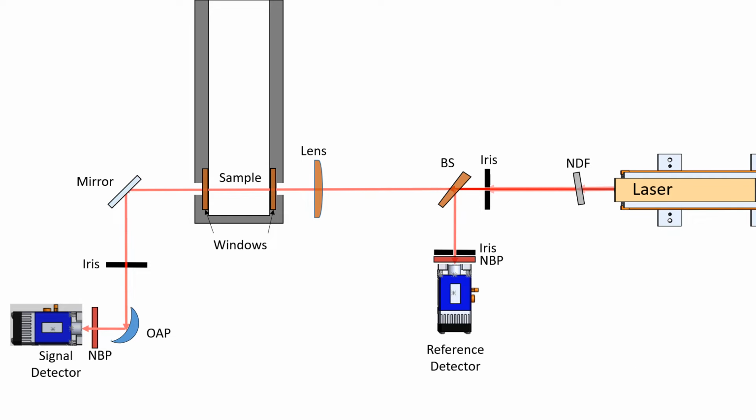With the flip mirrors down, they and the wave meter are out of the laser path. So I've taken them out of the diagram as well. Now the laser follows the path depicted. This is usually approximately what you'll see in an optical diagram. So let's follow the beam path through these different optical components and talk about their roles and relevant characteristics. The first component is the neutral density filter. The role of the NDF is to absorb some of the laser intensity to prevent damage to the detectors. If the laser output is greater than the maximum intensity rating of the detectors, an NDF will be required.